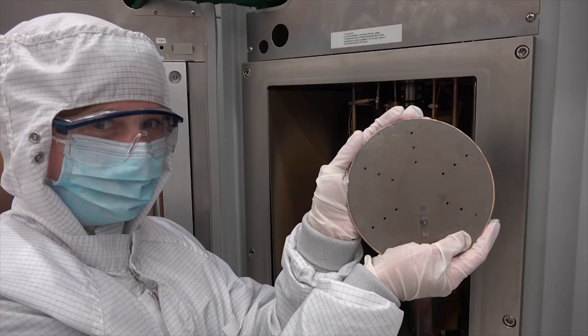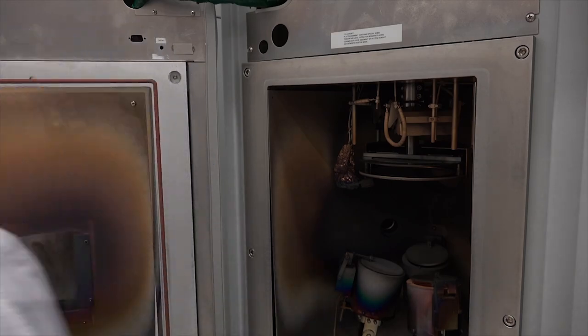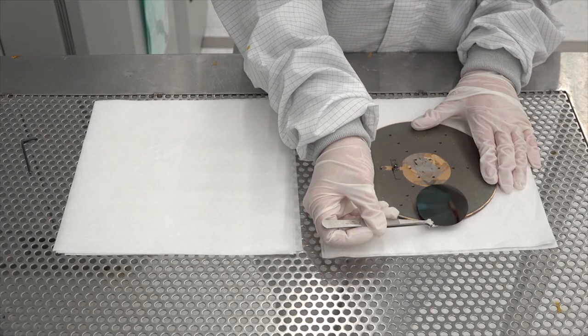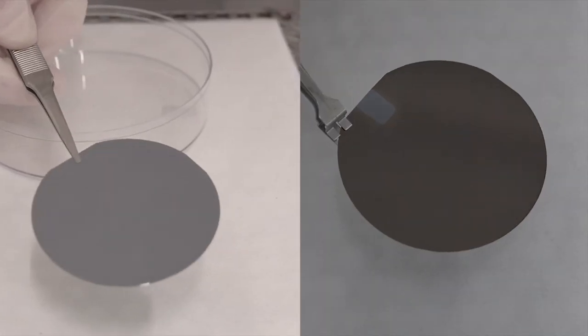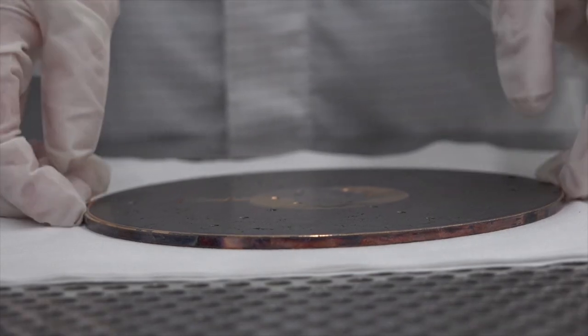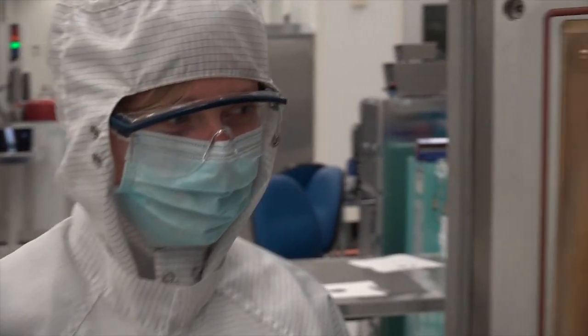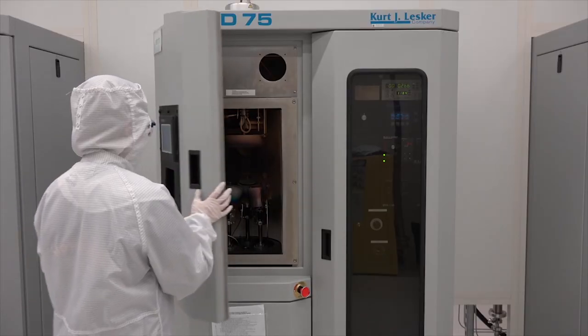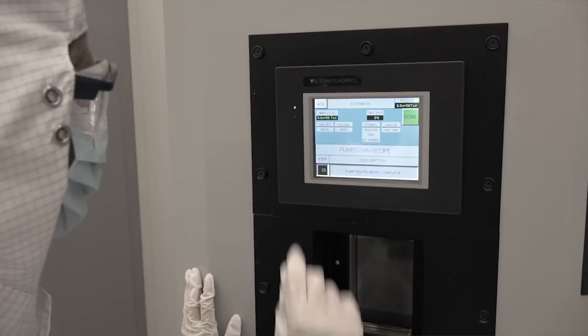That's it. We've deposited a thin film of titanium onto our sample. Let's compare the wafer before and after titanium deposition. The final step is to close the system and start the automated pump down sequence. Remember that we leave the vacuum chamber under vacuum when not in use to keep it as clean as possible.